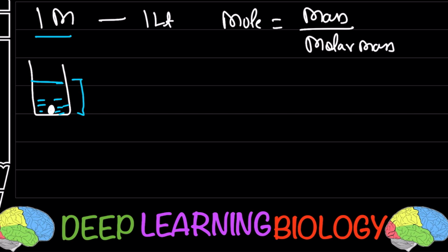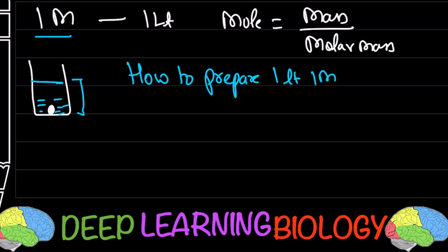Let us suppose we take one question: how to prepare 1 liter 1 molar NaCl. Very simple question.